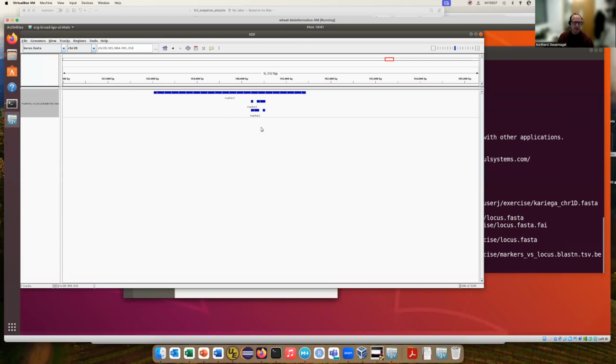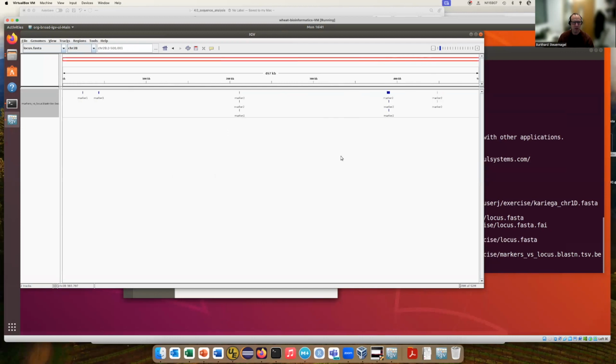So it probably makes sense to just get rid of all of that, because at the end of the day, when we work with our data, we want really just these two entries, marker 1 and marker 2, where they match, that we know exactly between this and this, we need to look at all our genes, and we don't want to be distracted by these other entries. So the two ways to do that is, well, coloring and make all of these red, or simply going into the bed file and removing these other lines.